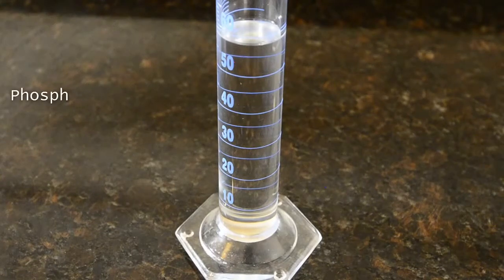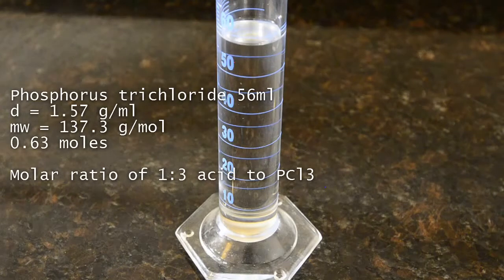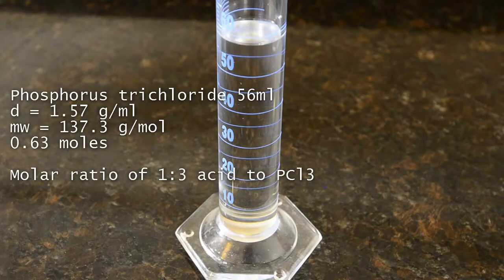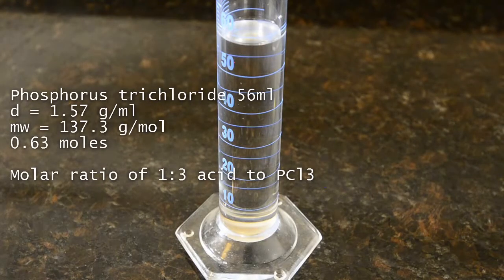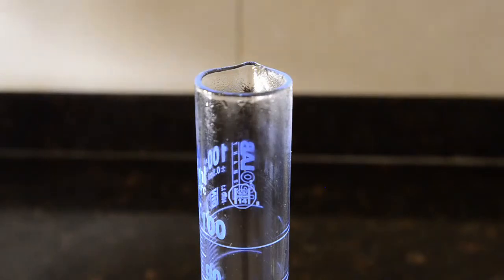Next, measure out 56 ml of liquid phosphorus trichloride. This is very toxic so do take great care with it and use only with ventilation present. As you can see it fumes in air so try to work quickly.